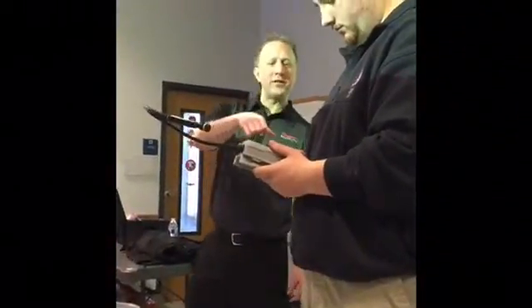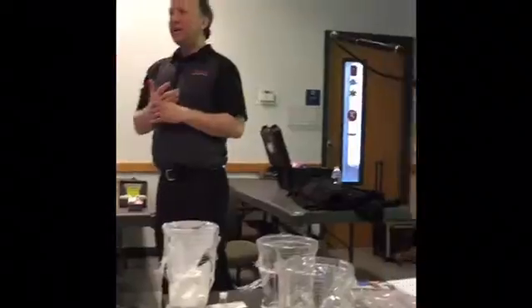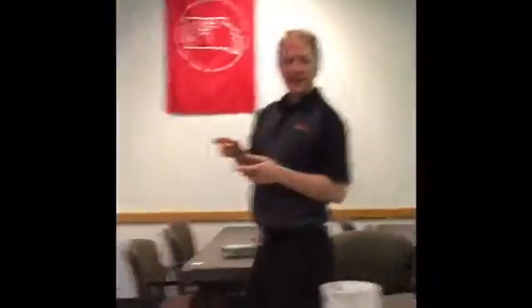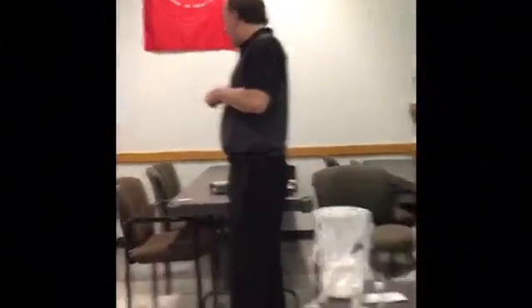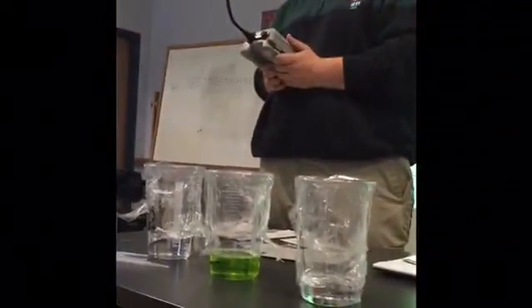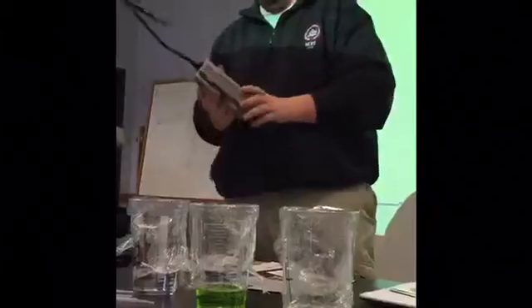And what color is this — green? Green. Awesome, it's hand sanitizer. So under the description — if we read that hand sanitizer on the FTIR, there's probably a lot of water in there too. It's highly flammable. The FTIR would actually say water and propanol, probably picking up both. The Raman doesn't see the water, just sees the propanol.